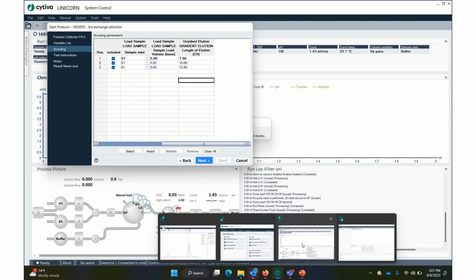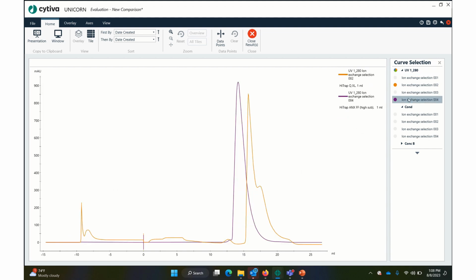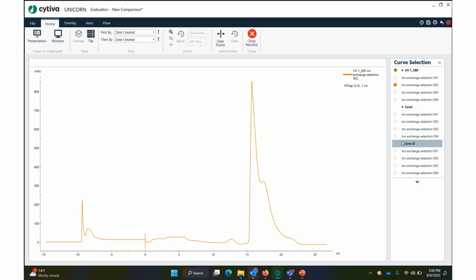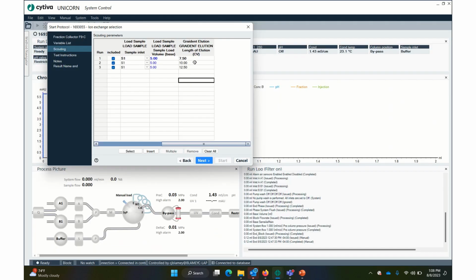Let's see here, evaluation. Yeah, here we go. So the idea is if we stretch the gradient out, let's turn these off, and hopefully that'll show concentration B there. If we make this gradient longer, hopefully this peak will separate more from this primary peak right here. That's the idea. Okay, so control. But the thing is I only have enough sample for 2 runs, not 3. So I'm going to exclude this first run right here. So we're just going to test 10 and 12.5.